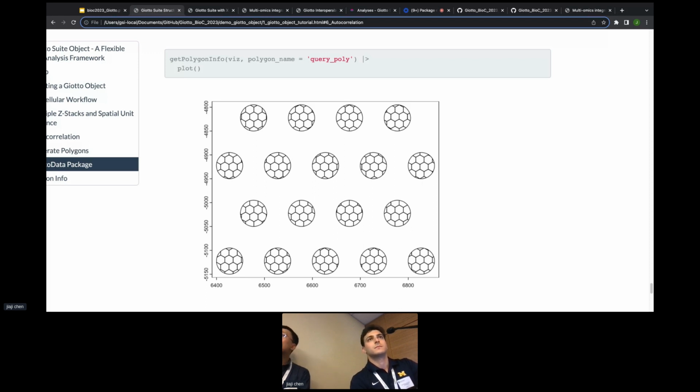So if you were trying to get this on Bioconductor or other areas, you would ask the community what part of the community you actually need. Sure. So the question was, if we were to make a big push to get this on Bioconductor, what part of our package development would we ask for assistance with in getting this package onto one of those bigger repositories? I think George can better handle this question. What part of our development? Yeah. Like, for example, do you need to use Basilisk for your Python code or not?